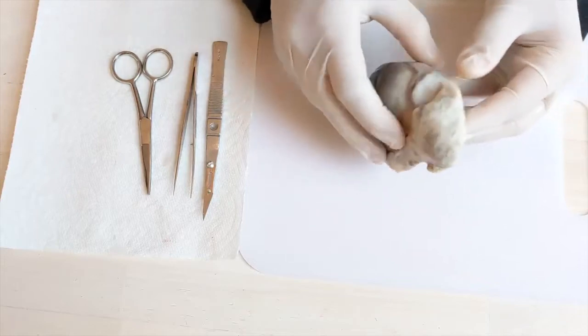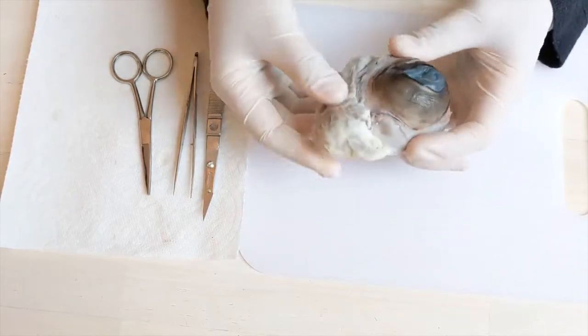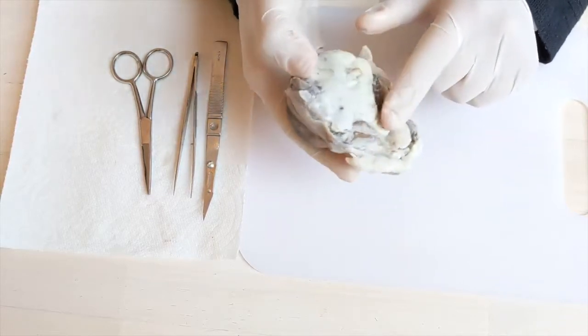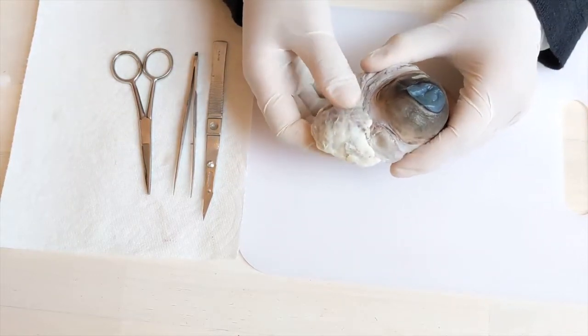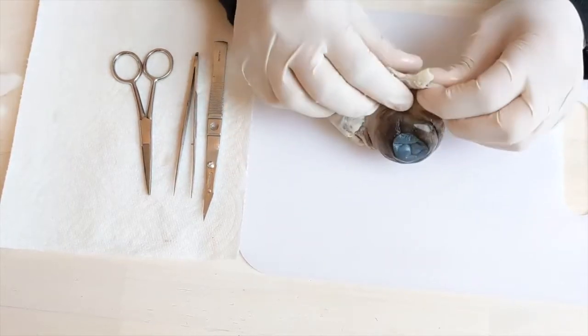As you guys notice, there is white stuff here all around the eye. Abdullah, can you guess what this is? I'm not sure. Can you give me a clue? Well, it's something that people go to the gym to burn. Oh, that's easy. Fat. Fat, exactly. So all this white stuff is fat.